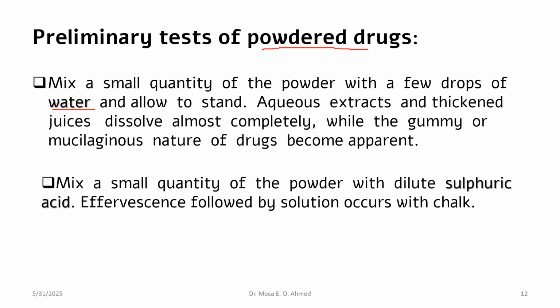And if we mix the powder sample with sulfuric acid, we note what happens to the sample. If there is effervescence, that means the sample contains chalk or calcium carbonate.